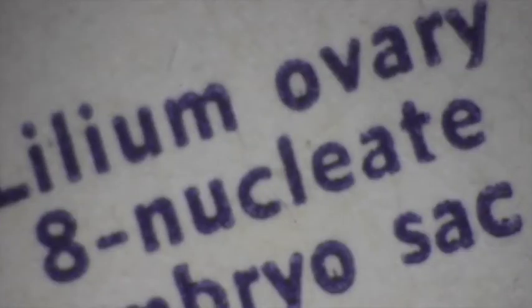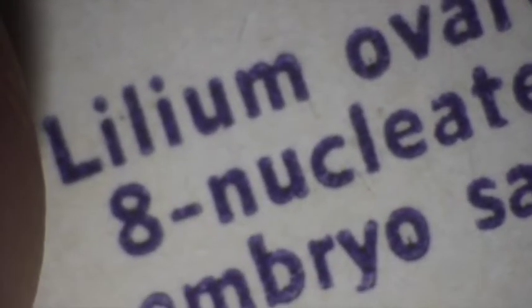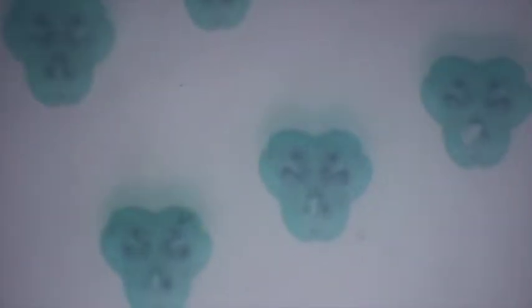Okay, so the next slide we'll look at here is a lilium, lilium being the lily genus, ovary, 8 nucleus stage. So I'm just going to shoot over here and let you see what's on this slide then. So here we have ovaries, and these are cross sections through the ovaries. Each of these cross sections, then I'll go ahead and just focus in on one. One of the characteristics of flowering plants is that the seeds develop fully enclosed inside the ovary.